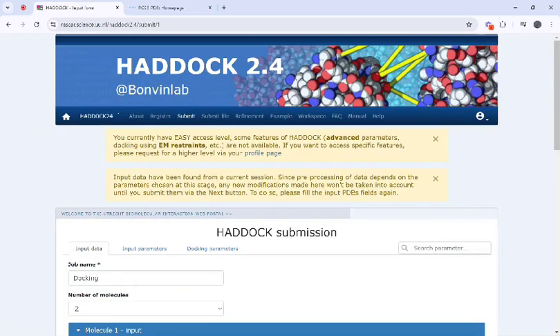Make sure to clean your files, remove the water molecules and hydrogen, and add the hydrogen atoms. For this purpose you can use tools like PyMOL or Chimera.